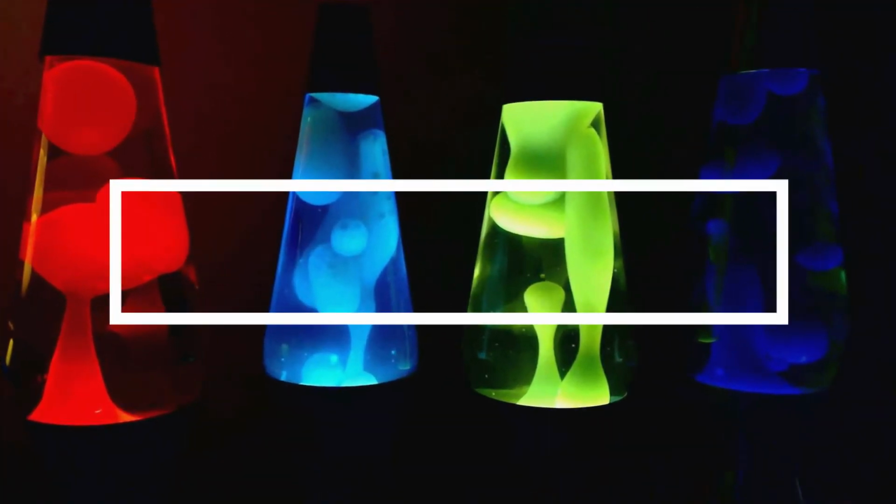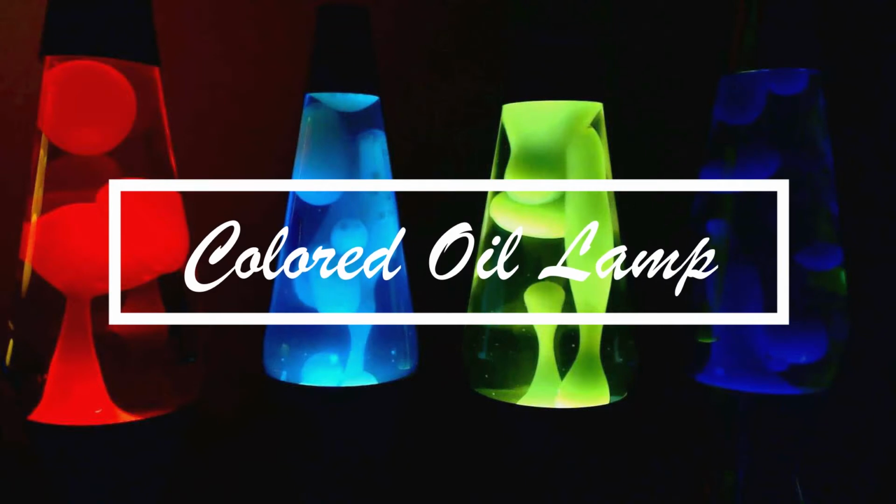The purpose of this experiment is to find out what reactions occur in the manufacture of this lamp and the differences that can be seen when using different acid indicators. Okay then, let's see what basic principle we use in this experiment.